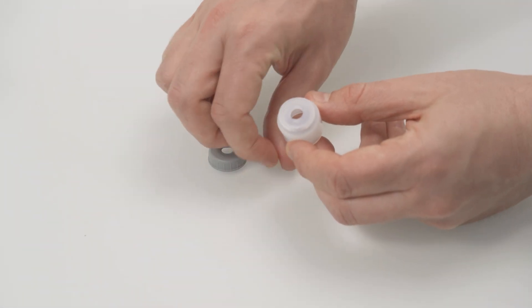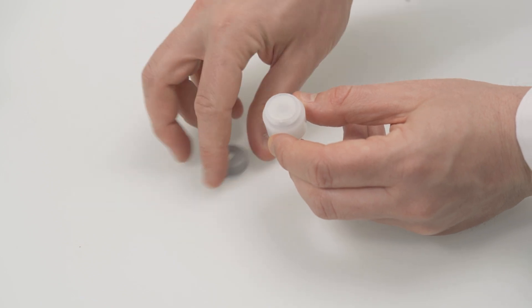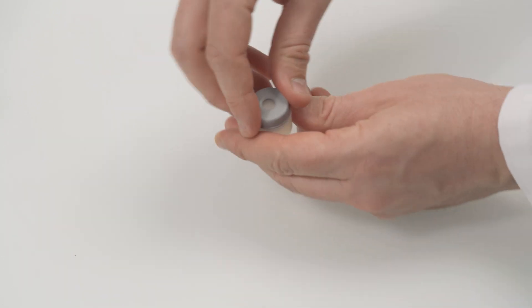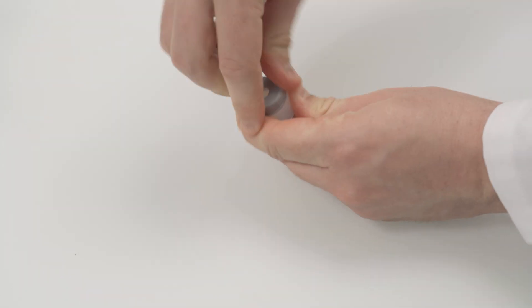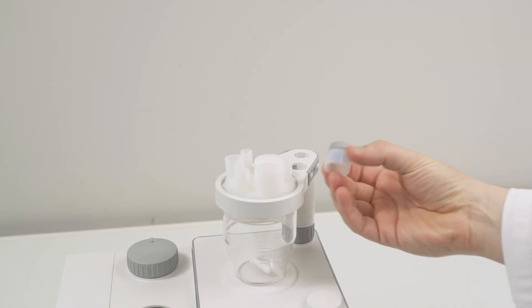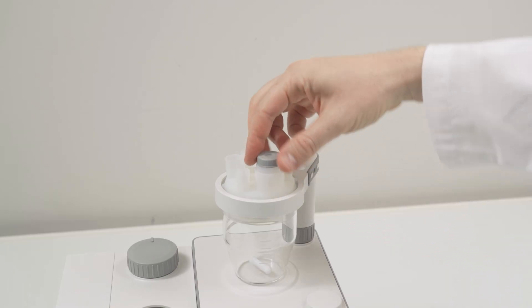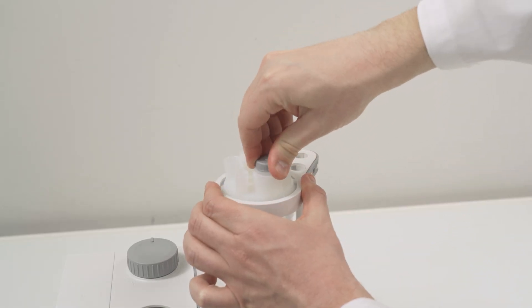Assemble the sample injection adapter. Plug it into the foreseen opening. Tighten it down by pushing it and turning it clockwise at the same time.